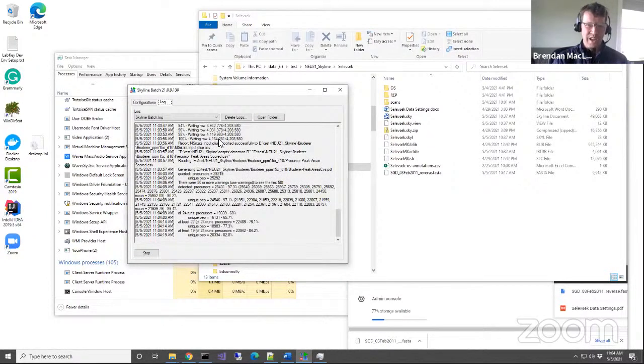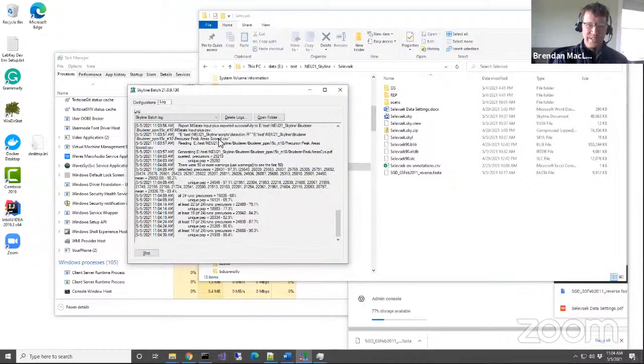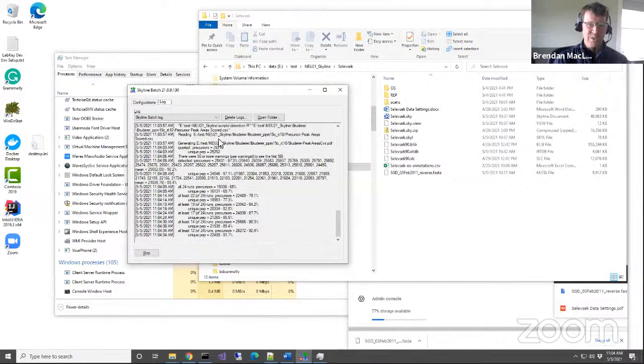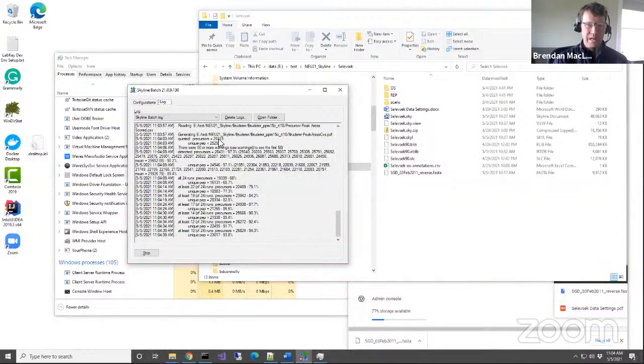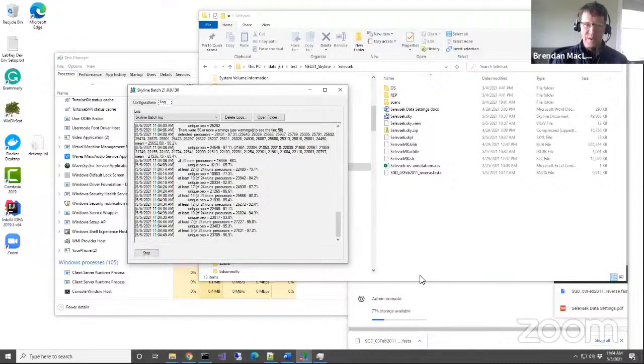I know that the Spectronaut team for a while had, and I have a pointer to it on Skyline somewhere, a page where they explained how to export a report from Skyline that could be used as a library inside Spectronaut. But go talk to the OpenSwath team about how to get a library from Skyline working with OpenSwath.